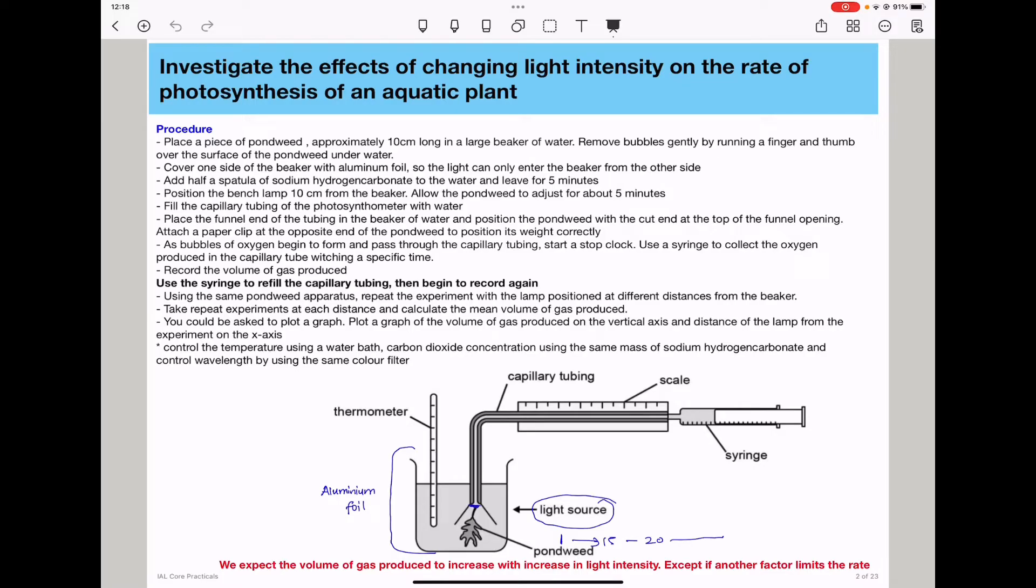You need to position the bench lamp 10 centimeters from the beaker and allow the pondweed to adjust for about five minutes. You need to allow it to adjust to the temperature and the conditions within the water as well as the light source before you can measure the experimental results. Fill the capillary tubing of the photosynthometer with water. Place the funnel end of the tubing in the beaker of water and position the pondweed with the cut end at the top of the funnel opening.